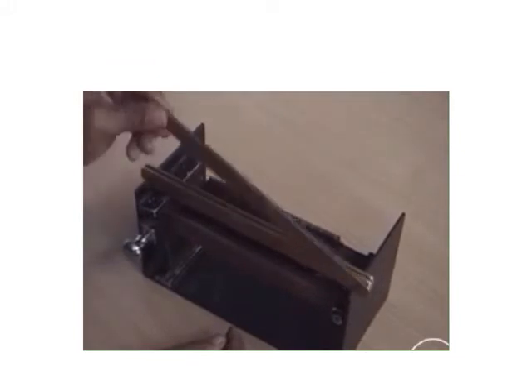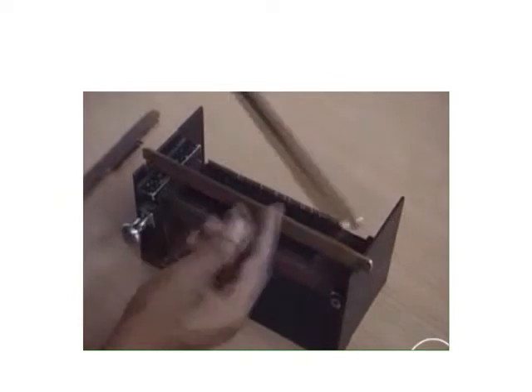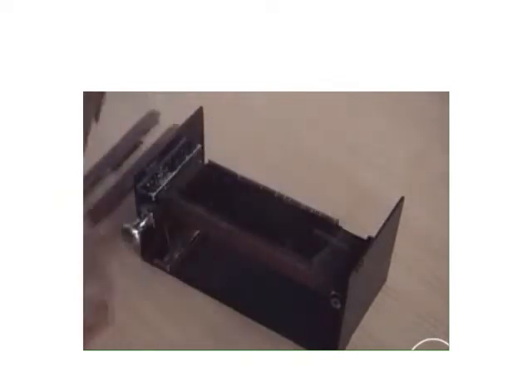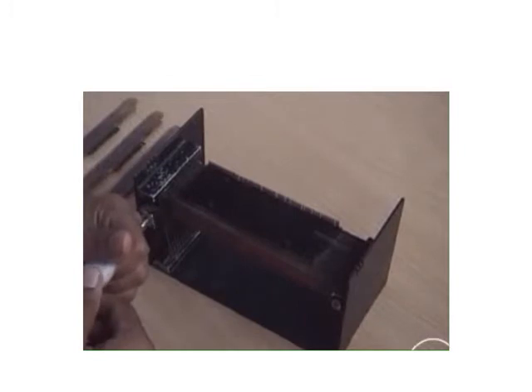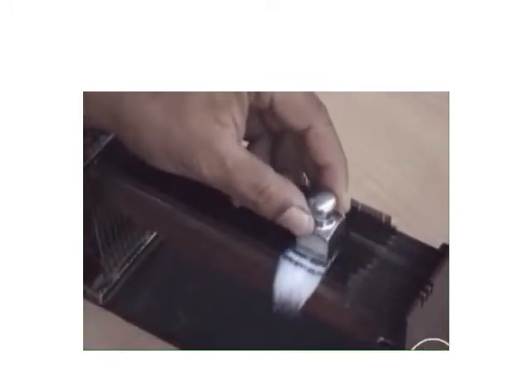Then you take the top combs aside and keep them on the left hand side like this. And then the prepared sample is kept on the back side, right hand side. The fiber is placed like this. And then using the depressor, the fibers are pressed inside the bottom comb.